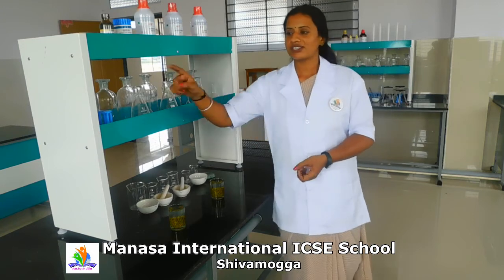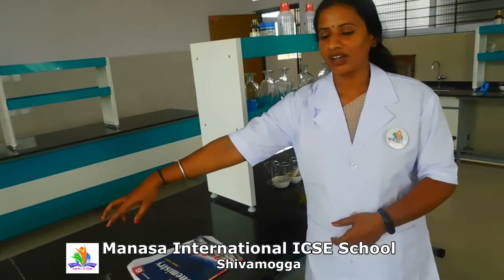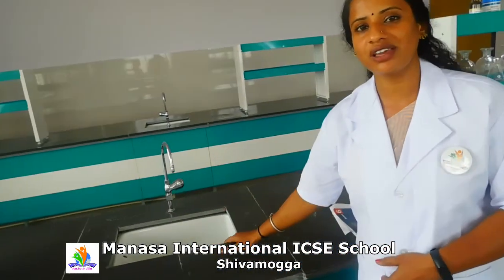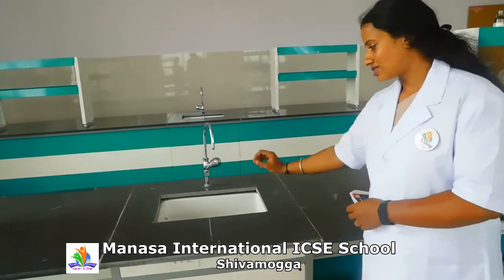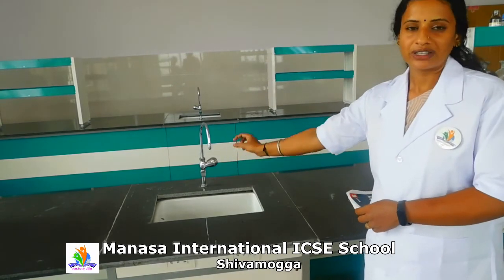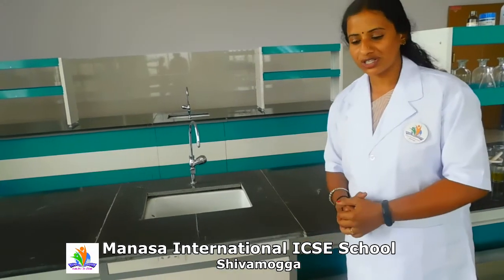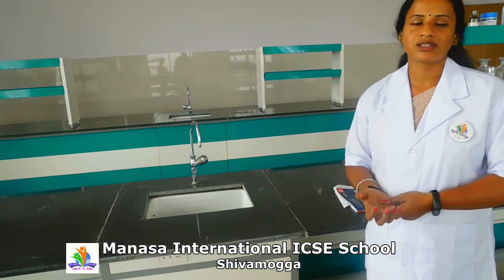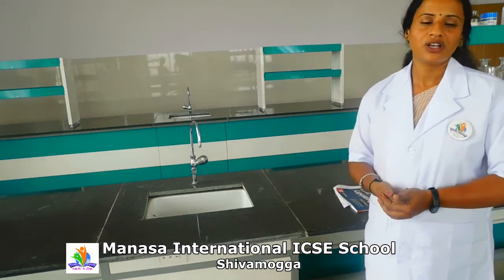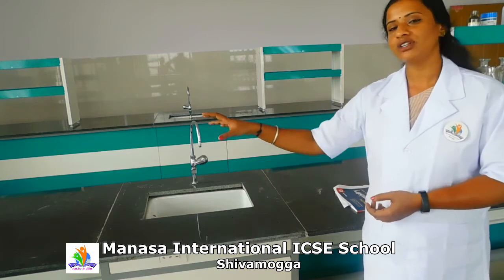Next we have the sink. Our entire chemical laboratory is provided with sinks. The function of the sink is that whenever you are conducting any experiment, you turn on the tap and discard any solution only under flowing water. Because some reactions in chemistry may be vigorous, fumes may come and sudden burns may be caused. That's why our chemical laboratory is provided with a sink at each table.